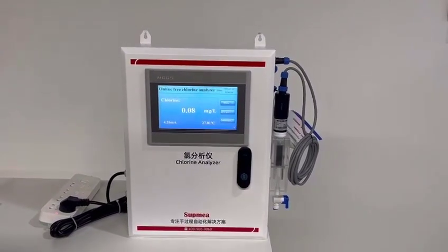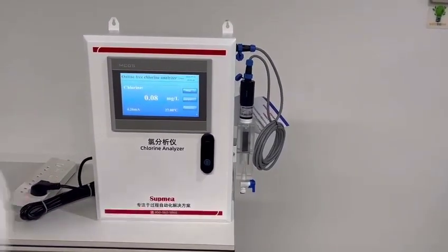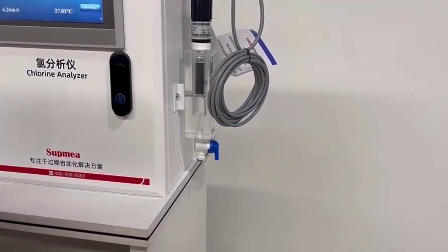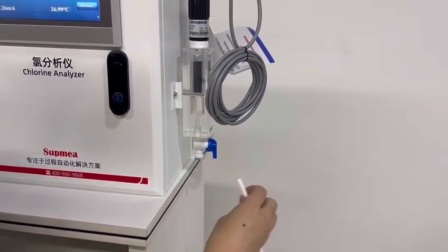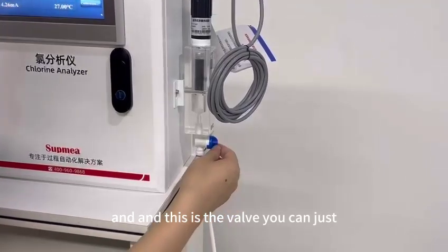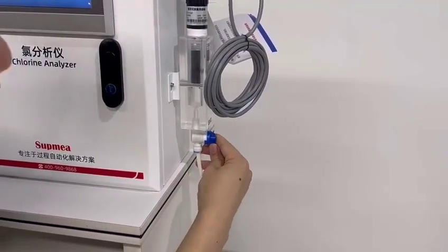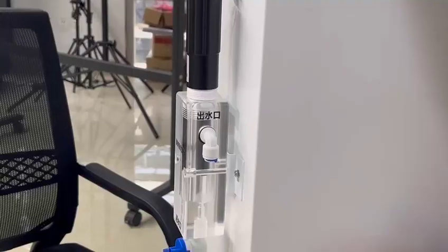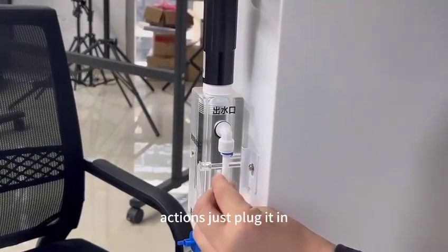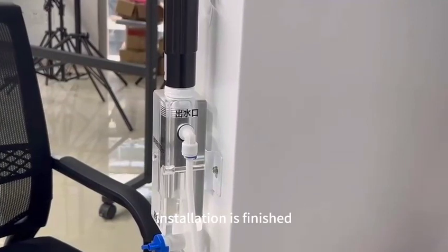Step two: we will install the water pipe. As you can see here, this is a quick connector and this is the inlet. It's very simple — you just plug it in. This is the valve you can use to adjust the flow rate. On the back side, this is the outlet, and you do the same action — just plug it in. The water pipe installation is now finished.